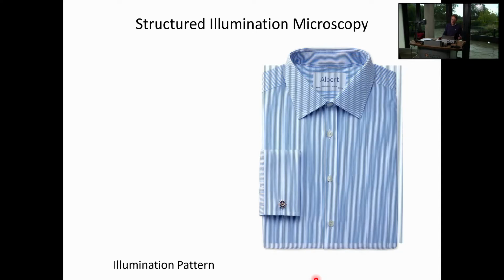And it is easy to understand, of course, that these bands convey information about the underlying structure. The idea of structured illumination microscopy is to record these low frequency beats that you can clearly see, and then, if you know what the excitation pattern was, you can use Fourier tricks to get the original pattern back. That's the idea of structural illumination microscopy.